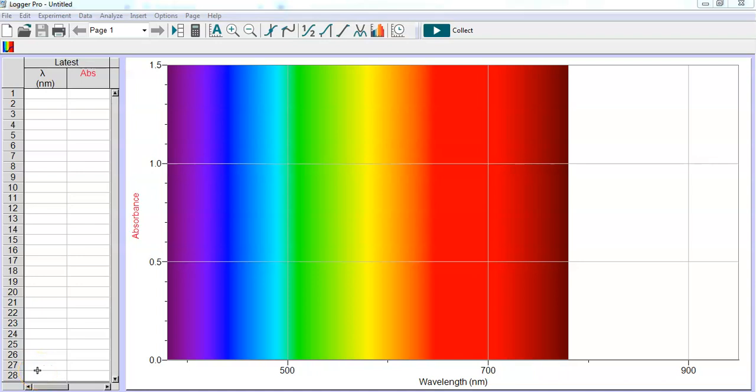In procedure 4.3, you are going to determine the optimum wavelength for monitoring tyrosinase activity. To do this, you will prepare a cuvette that has 900 microliters of buffer, 150 microliters of DOPA, and 150 microliters of the tyrosinase enzyme. You will allow this reaction to proceed for 5 minutes. In the end, you should see a solution that has a light orange color.